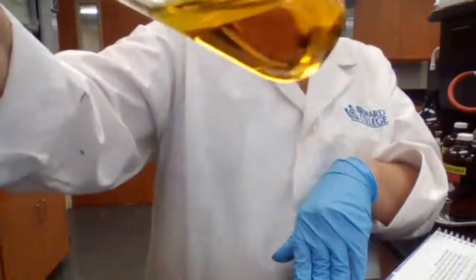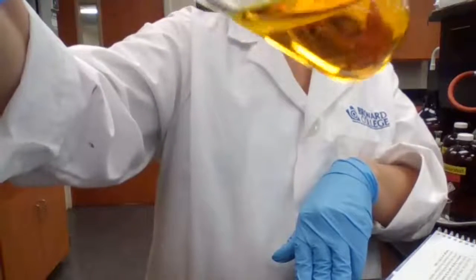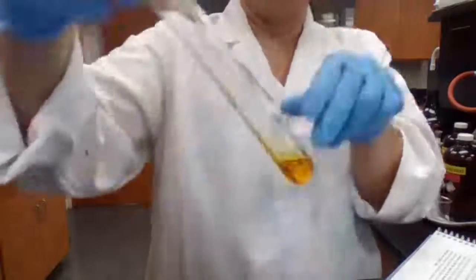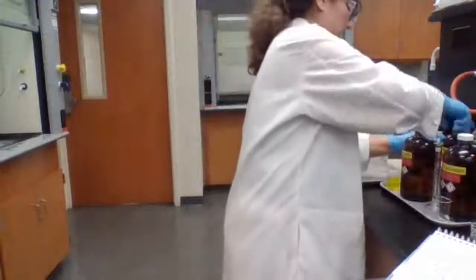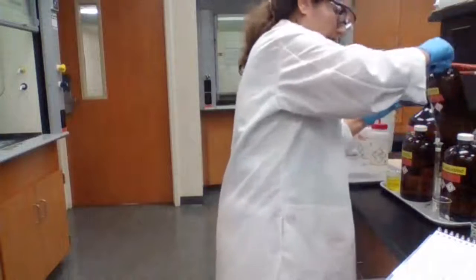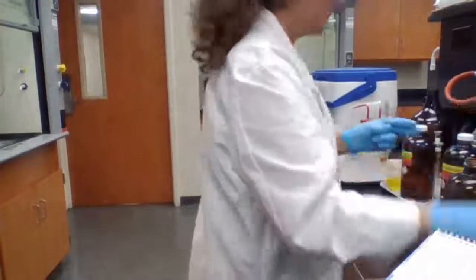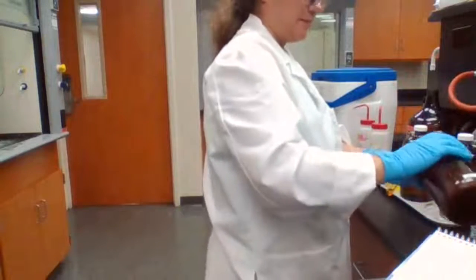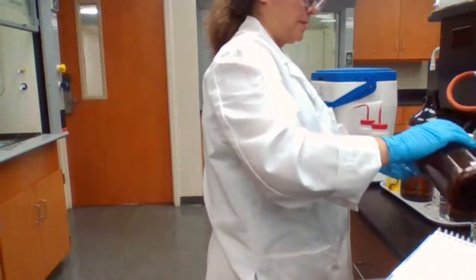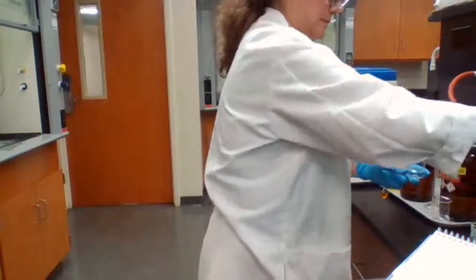This is after adding H2SO4. Record the new color. Then I want to add sodium hydroxide. Let me find a dropper.